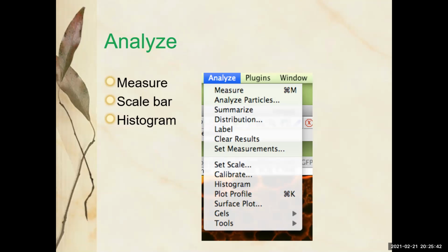I actually really encourage you to be a little bit lost, or actually to be a lot lost with software, because all imaging software is different and they keep updating it. It's really good not to be scared of it and just to feel completely free to wade in and wander around and be like, what does this do? I have no idea what this does, but my image looks better. Let me find out, or whoa, that made my image really weird. Okay, I must stay away from that.